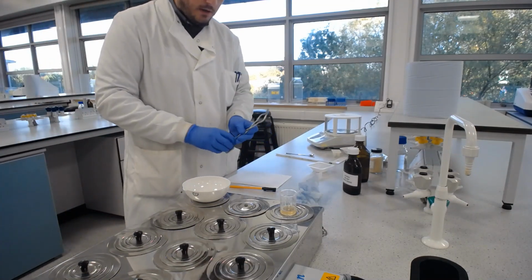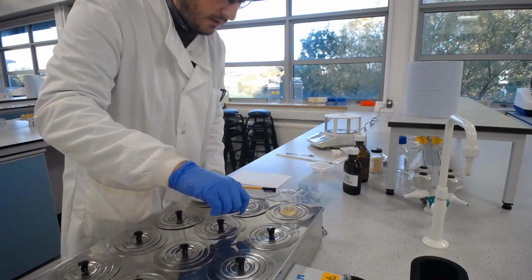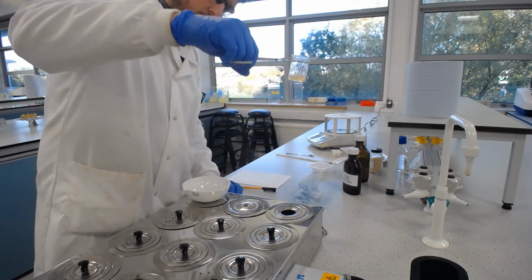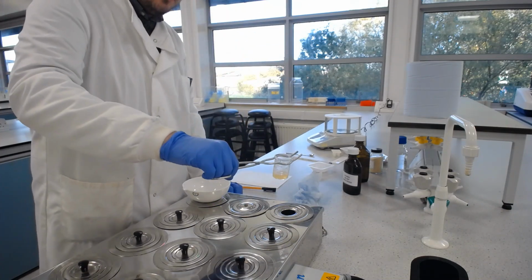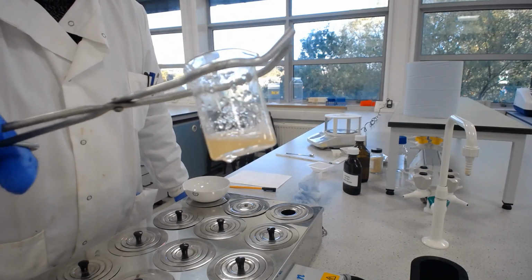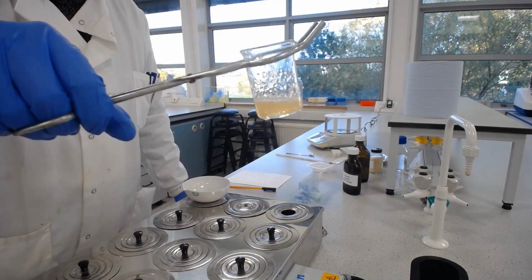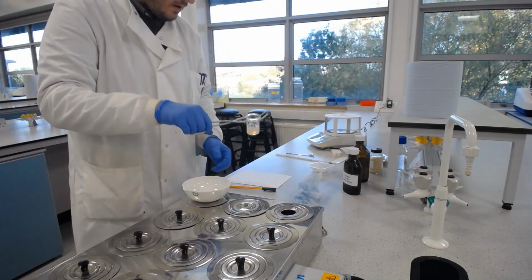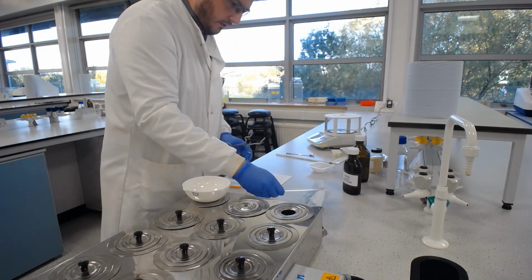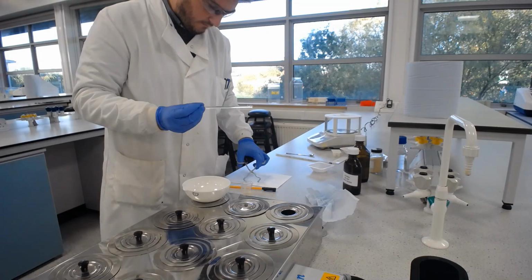So let's have another look here. I can see now I've got a much clearer mix. Again, I've still got some granules up the side of the beaker, so I'm going to need to work to get those incorporated. But the actual mixture at the bottom is a nice homogeneous mixture. So I will just do that work now to get those incorporated.